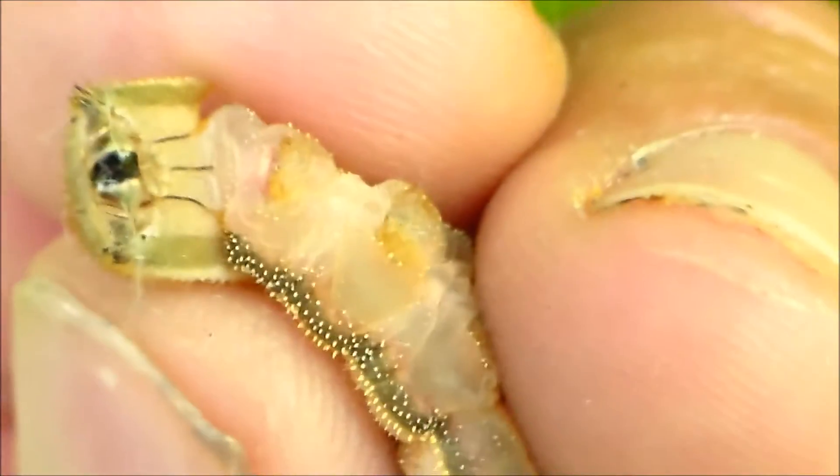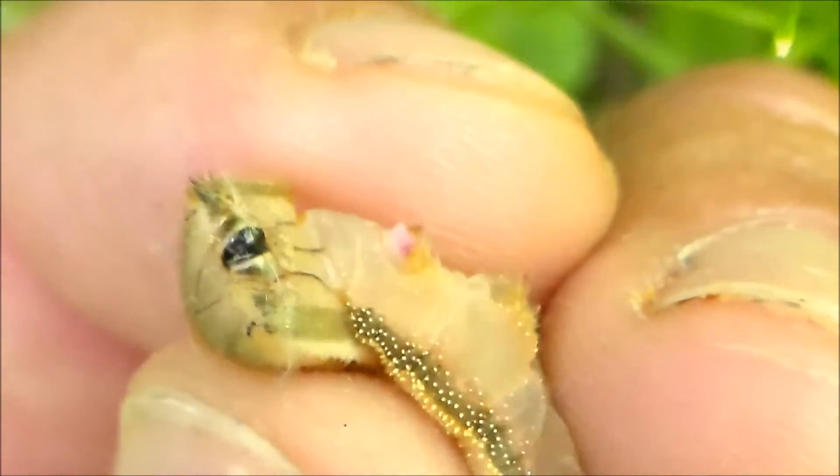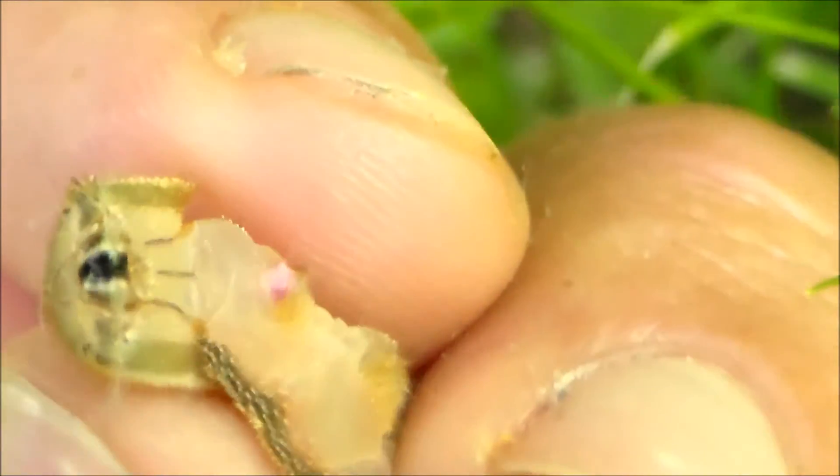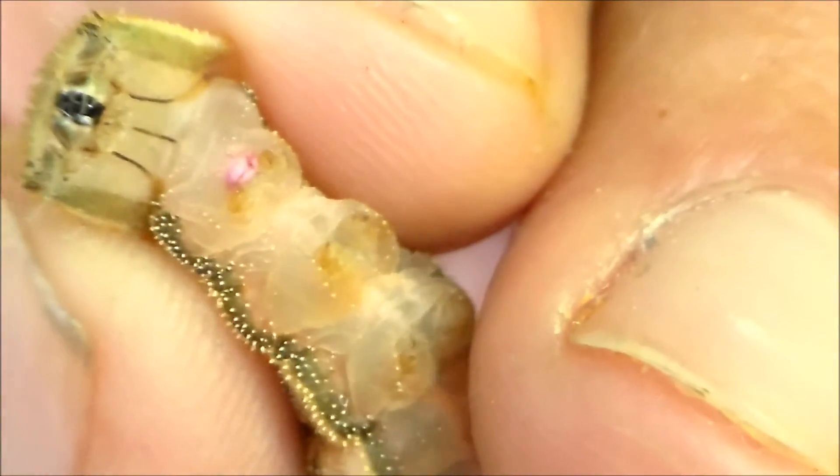So I'm gonna go ahead and squeeze it again — you can see it come out. Here it comes. There it is. This is what it's all about — it's a little pink thingy here.